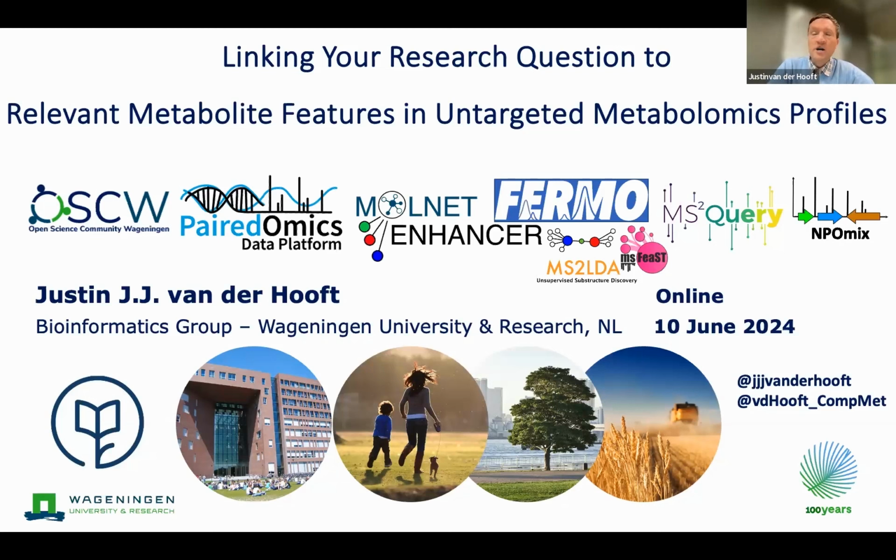And the reason behind this is that usually when we start to do metabolomics research, we have questions, and then we do the data collection, sample collection, acquisition, and then we start to do the analysis. And then at some point we end up with features, and then we are asked, okay, in how far are they actually relevant for our question?